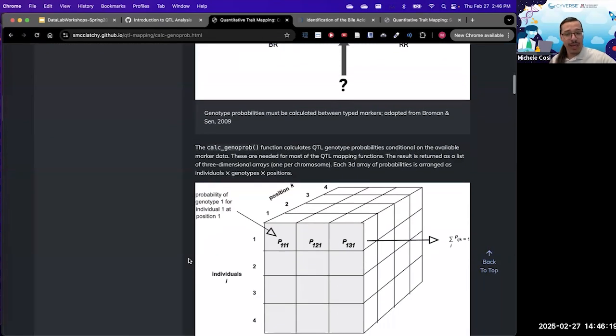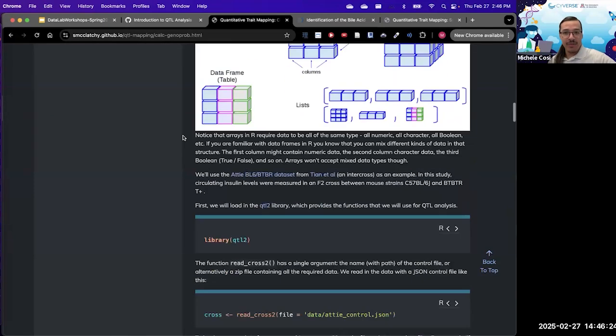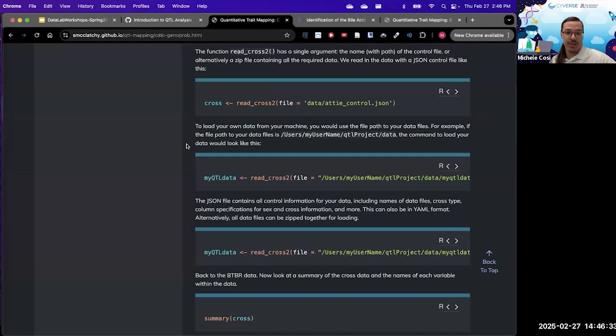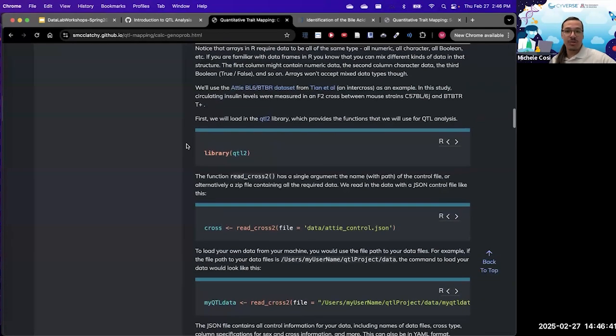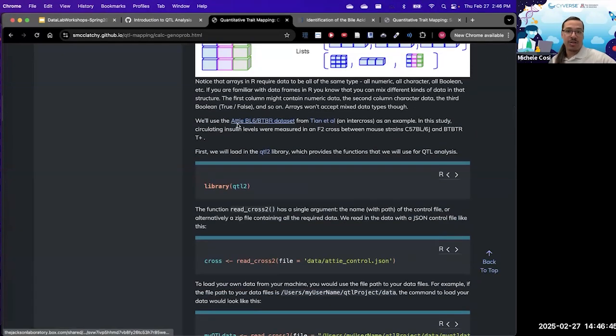It also explains very well what R is looking for and gives you the code that you require in order to execute QTL analysis for your own research. Not only does it give you the code, it also gives you the files necessary, which you can find within the code itself, in order to carry out this lesson.